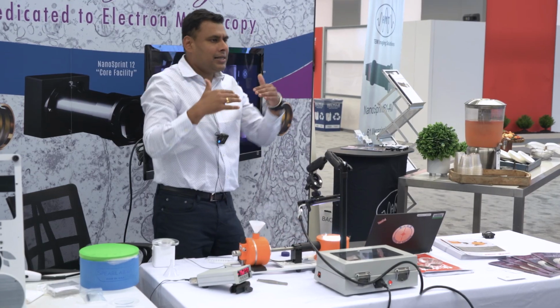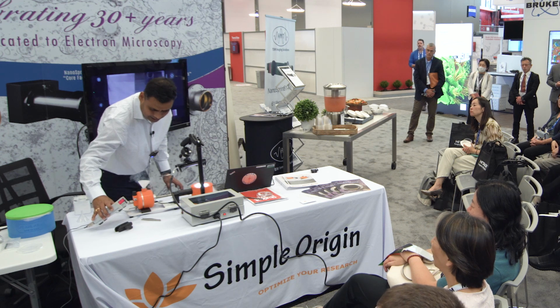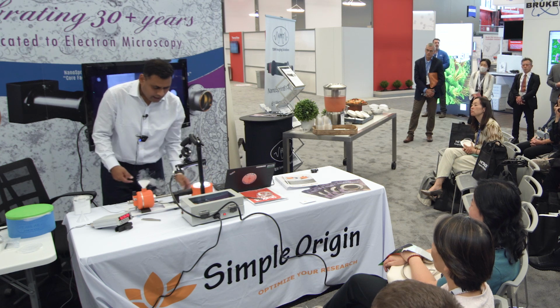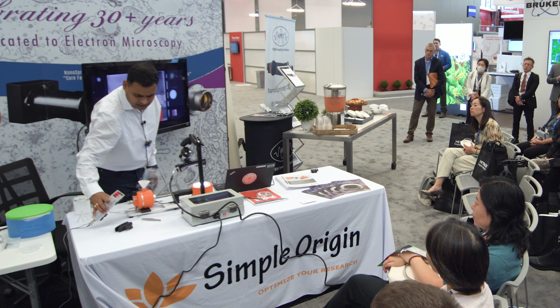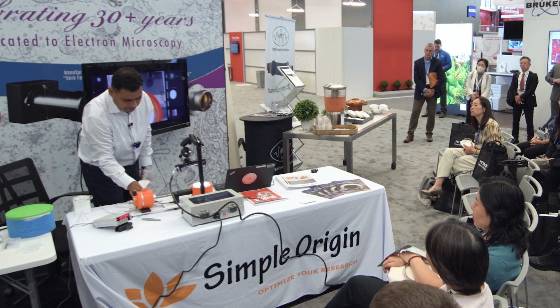The clamp is designed such that there is a constant spring force on the specimen, which maintains good contact with the cold tips. Technically, you'll be doing this at minus 190. Once you do the transfer, you need to pull the tip into the holder. And the next step would be getting there, but I'll stop this.